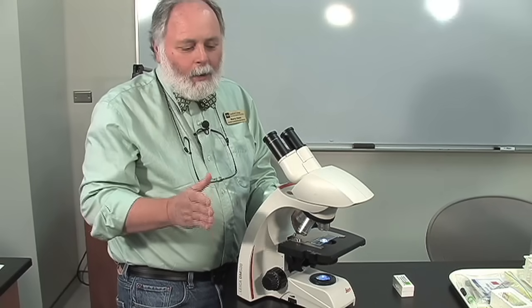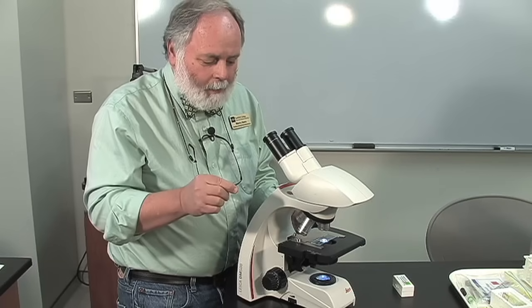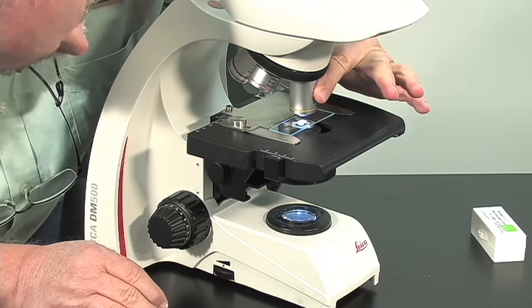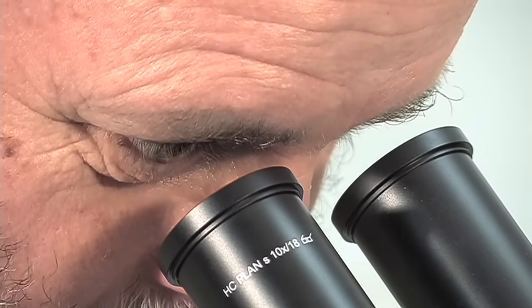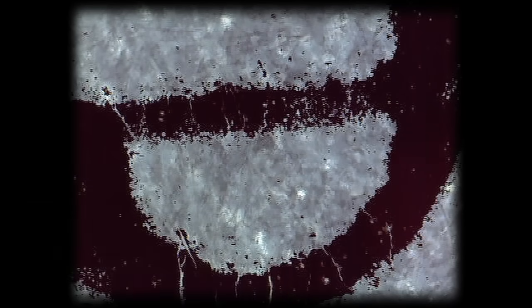At this point, we want to center the specimen and then go to medium power. To go to medium power, I'm simply going to click the medium power lens into place. With medium power, I'm going to look through the eyepiece, use my coarse adjustment a little bit, and my fine focus again. Don't forget — use your diaphragm to get those good details.